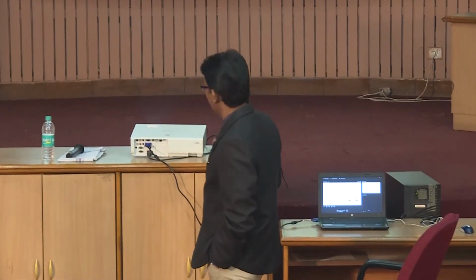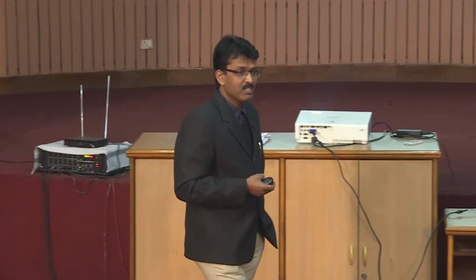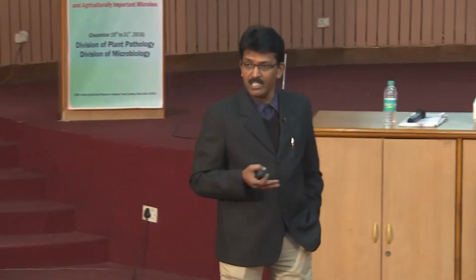Coming to the mixture here, I am showing the same thing once again. The template here is a template derived from RNA. So today's practical is on that only. We will be demonstrating how to do RNA isolation and how to convert the RNA into cDNA, right? Also, a very common terminology you will find in literature is one-step real-time PCR and two-step real-time PCR. It's very simple. When you are working with RNAs, RNA cannot be directly amplified. You need to convert it into cDNA, right?